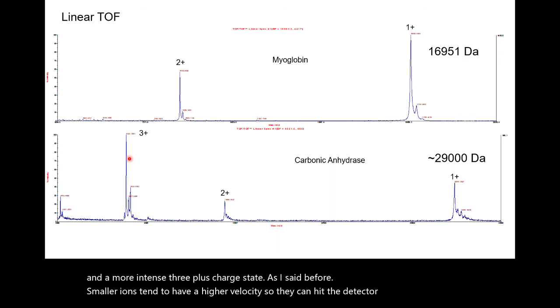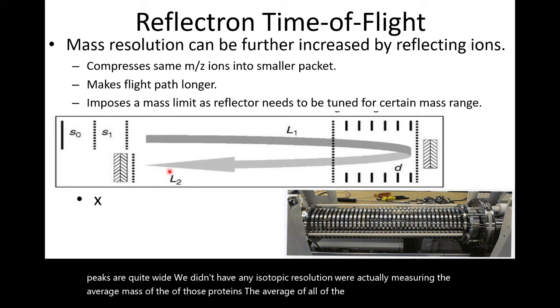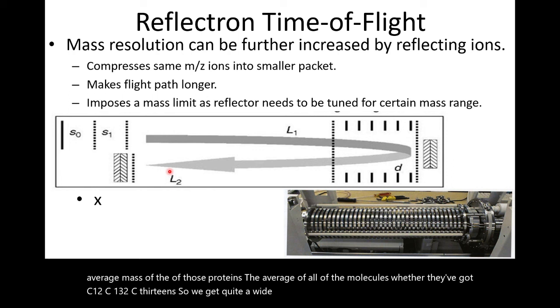One of the things that you would have noticed on the last slide is that those peaks are quite wide. We didn't have any isotopic resolution. We're actually measuring the average mass of those proteins, the average of all of the molecules, whether they've got C12, C13, two C13s. So we get quite a wide peak that is not as accurate as we would like it to be.